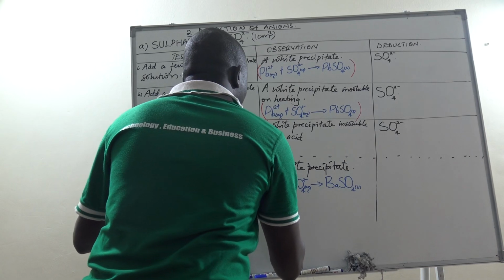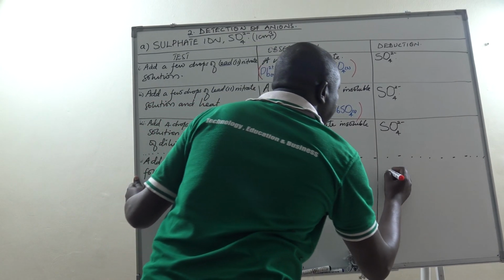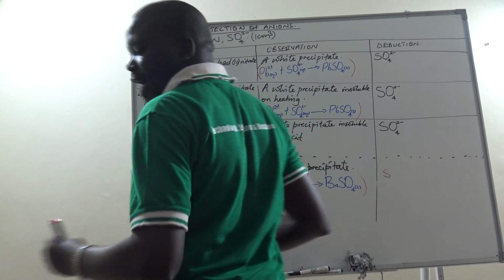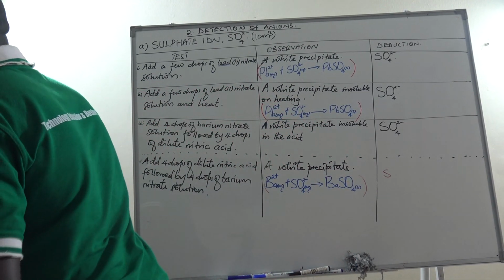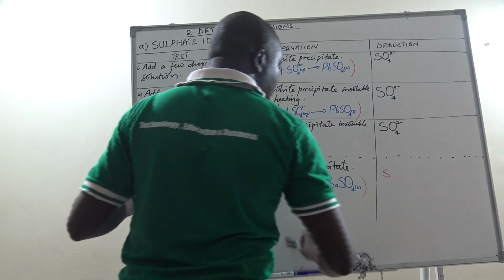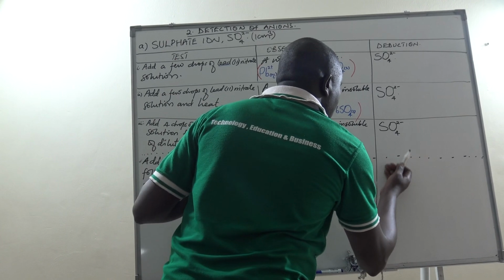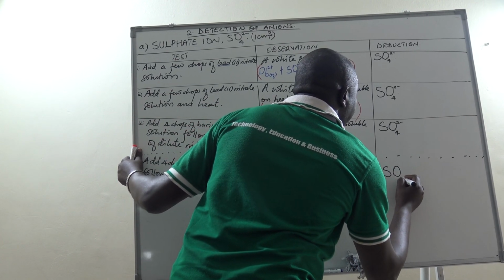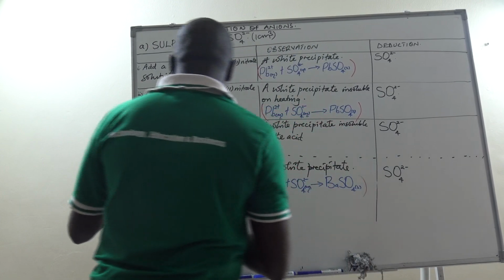Of sulfate ion. So this one means that there is sulfate ion in the solution under test. So we confirm sulfate ion. As simple as that.